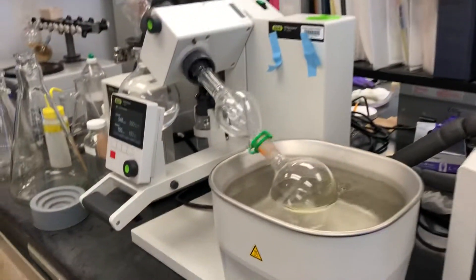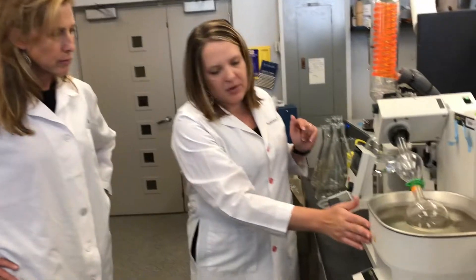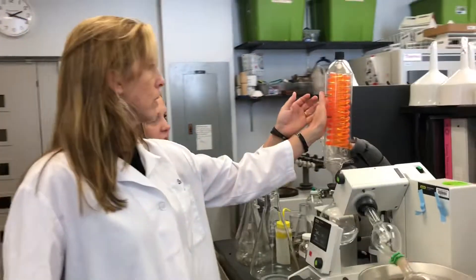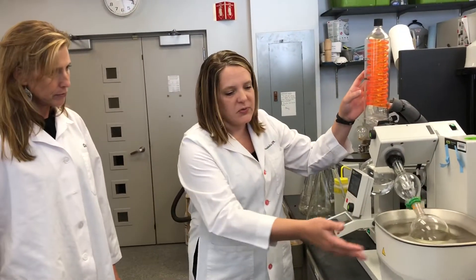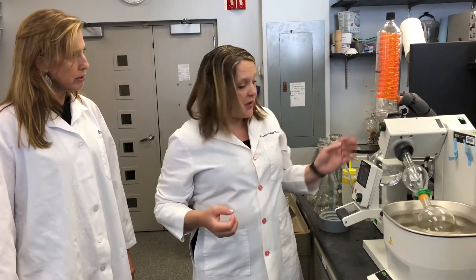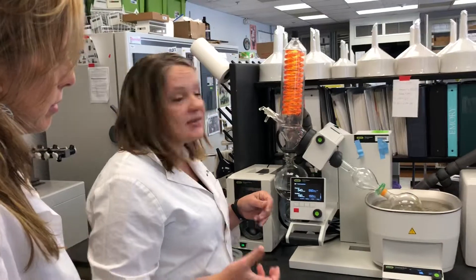Here's a good example of one. We have a heating bath at the bottom at 38 degrees Celsius. And if you touch this, it's nice and cool — we have a circulating chiller. We take that filtered extract, put it into one of these bottles. The heat helps to evaporate off the alcohol, and when it gets to this stage, it hits that cold coil and drips off. At the bottom we have the liquid ethanol in water that's coming off, and what will be remaining inside the glass is the extract.